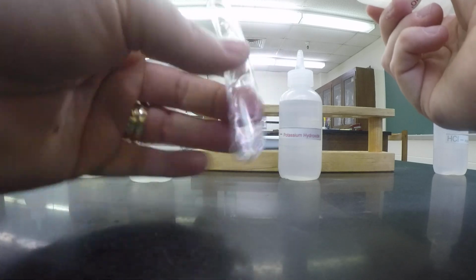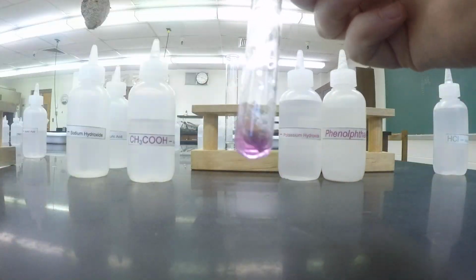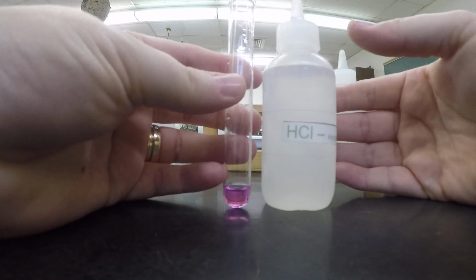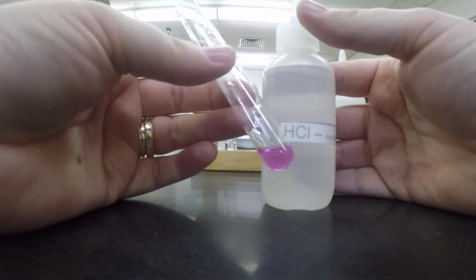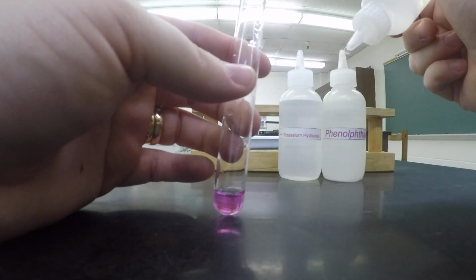Okay, add 1, 2. And we'll do 1 more to grow on. Okay, so see how pretty pink? Alright, very pretty. Okay, so now I'm going to add HCl, and this is again a titration. I'm going to add 1 drop at a time, and when this changes completely, that means it's neutralized, and what's left in my test tube is salt and water. So, do this.